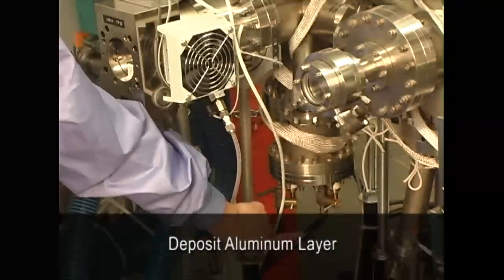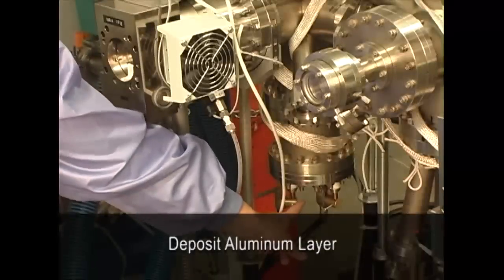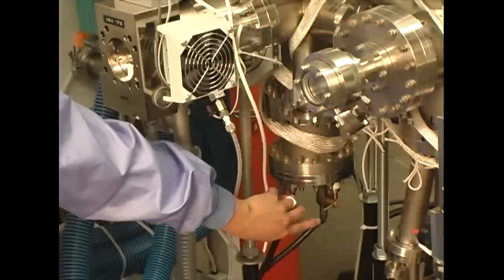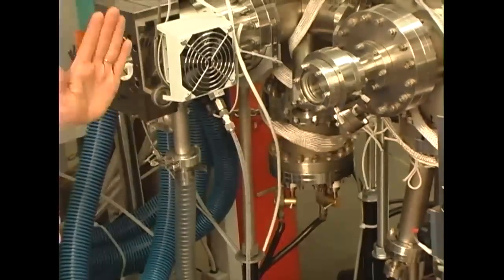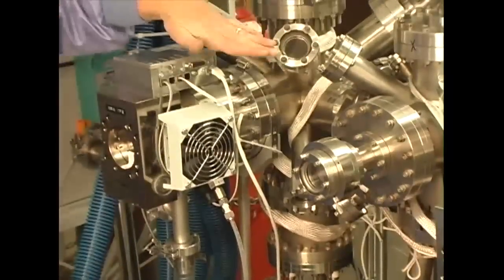The deposition of the aluminum layer is very similar to the organic deposition. Two leads supply current to the boat containing aluminum. The aluminum moves up through the chamber, spreads out, and is deposited on the substrate through the mask.